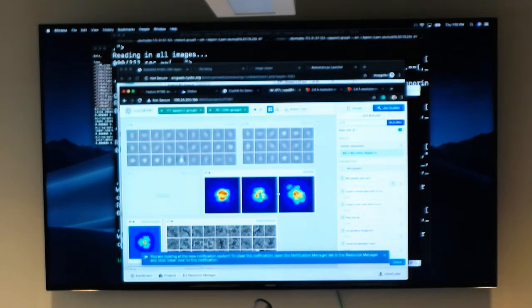Would you know what they're saying? But what's the part? I've done it and then never got that back. It's going to be an MRC. You can do it somehow. You don't have to be told. And then you just queue that up.